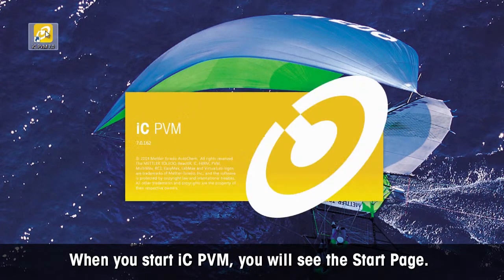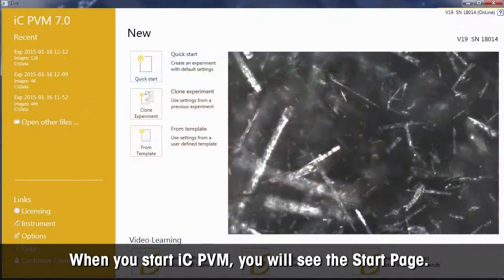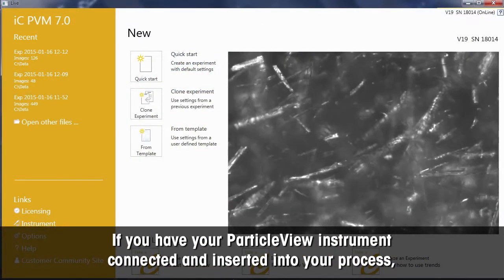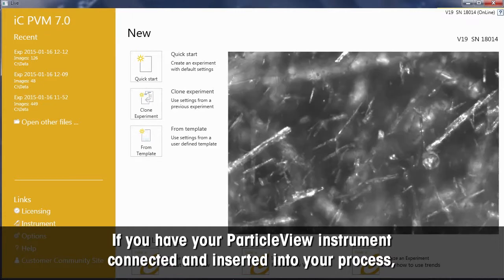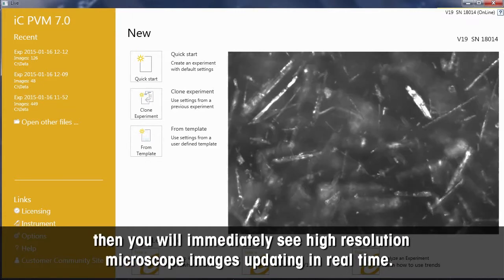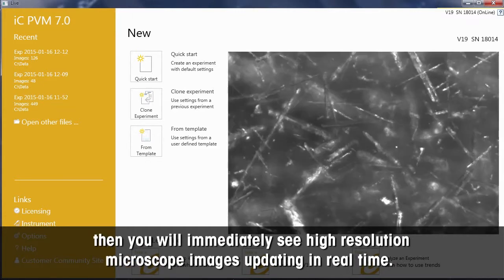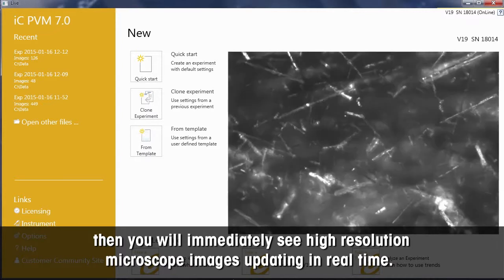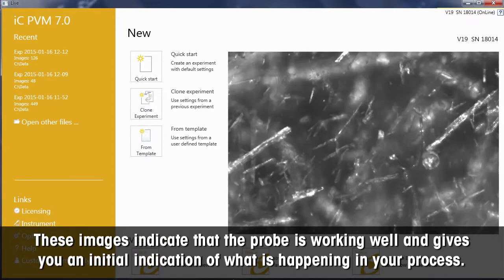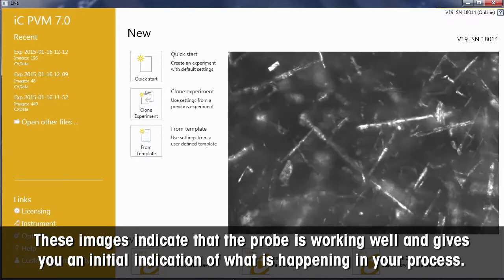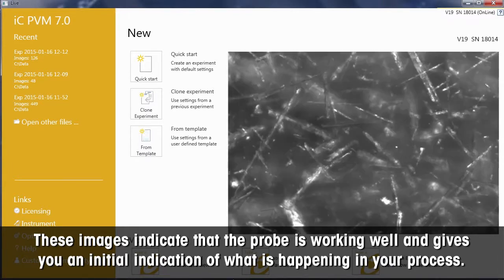When you start ICPVM, you will see the start page. If you have your ParticleView instrument connected and inserted into your process, then you will immediately see high-resolution microscope images updating in real-time. These images indicate that the probe is working well and gives you an initial indication of what is happening in your process.